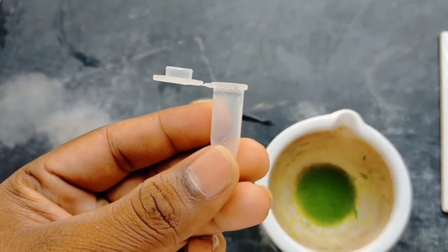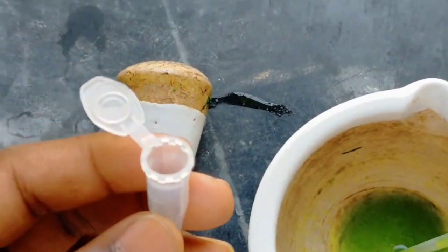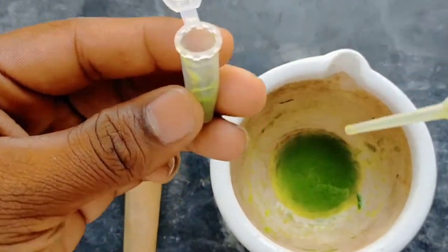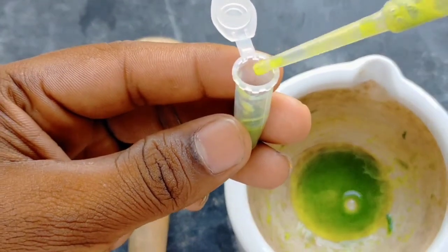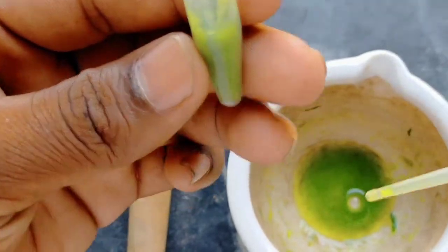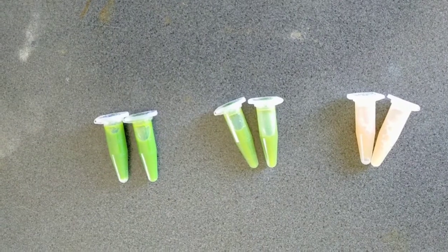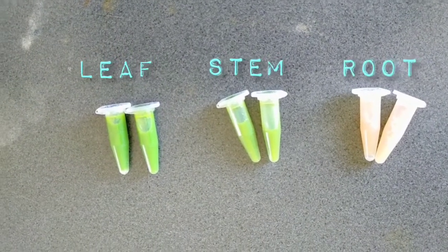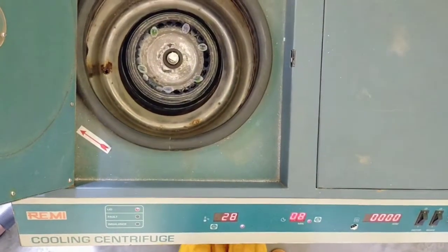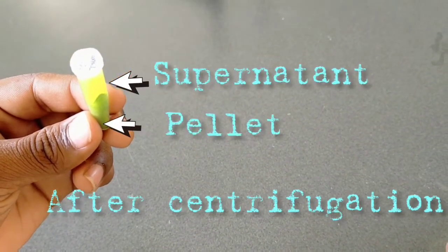Take an Eppendorf tube and add the pasted leaflets into the Eppendorf tube. And centrifuge it in the centrifuge at 100 rpm for 10 minutes. Samples from different parts of the plants are taken in the Eppendorf tube. After centrifugation, supernatant and pellet is formed.